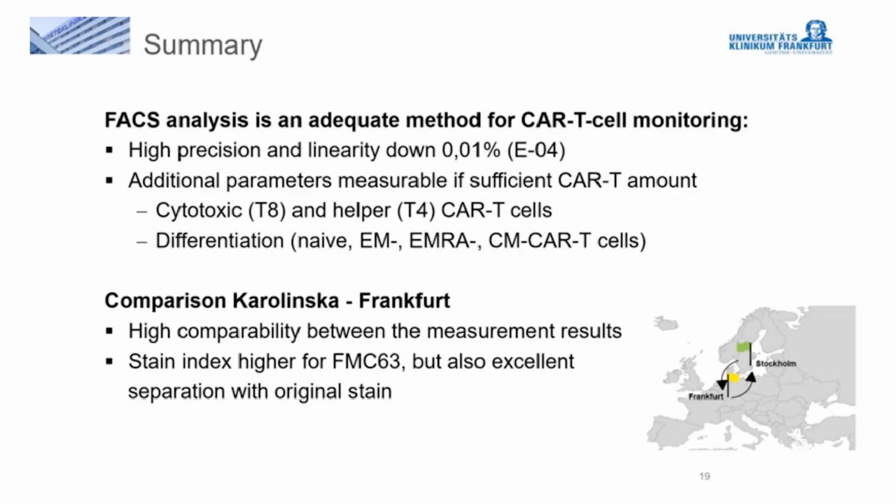To summarize, I have presented two topics. First, the establishment and validation of an assay for CAR T-cell measurement by flow cytometry. And we could show a high precision and linearity down to 0.01%, and that additional parameters could be measured, like the cytotoxic and the helper CAR T cells, and also their differentiation into naive, effector memory, and so on.